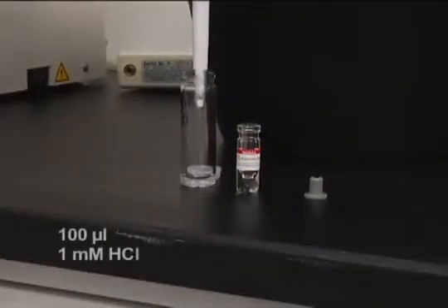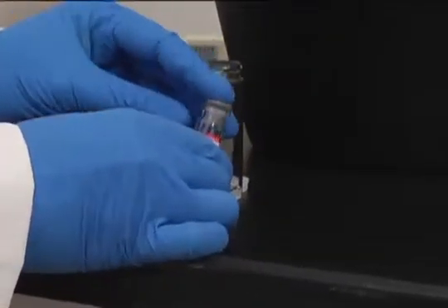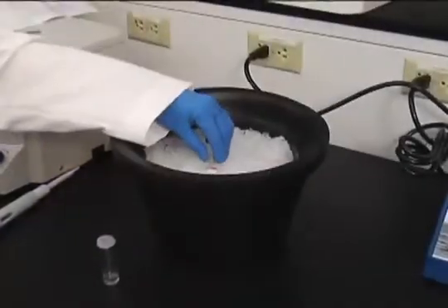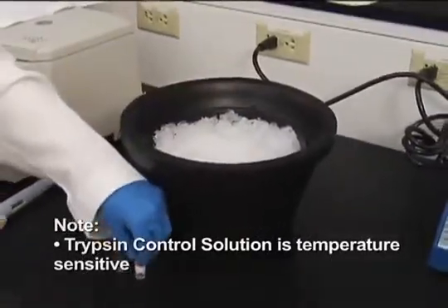Finally, prepare the trypsin protease control by adding 100 microliters of 1 millimolar hydrochloric acid to the vial of lyophilized trypsin, and mix briefly to ensure the trypsin is dissolved. Storing the trypsin under acidic conditions increases its stability. Note that the trypsin control solution is temperature sensitive and is not stable at low concentrations.